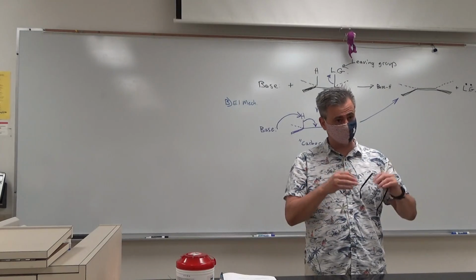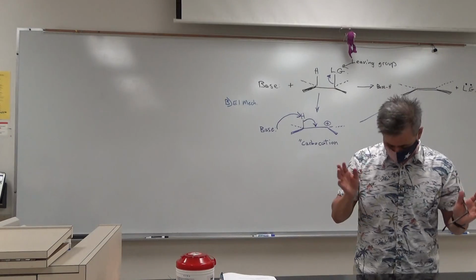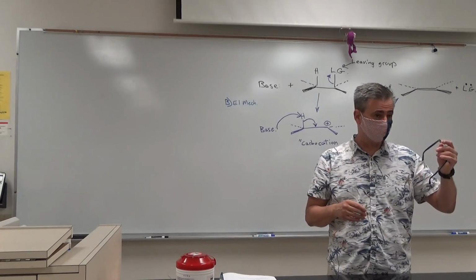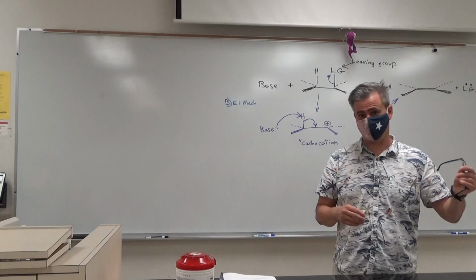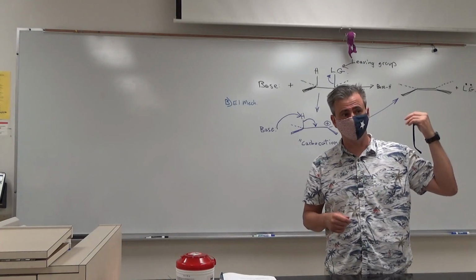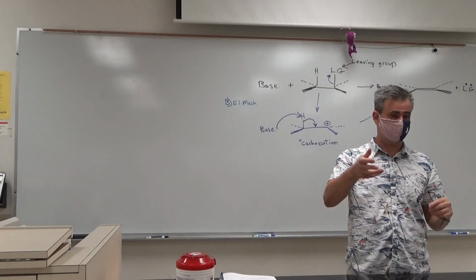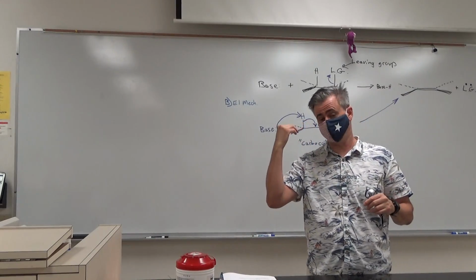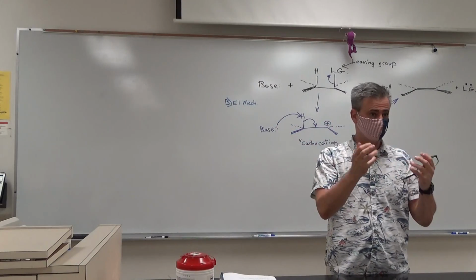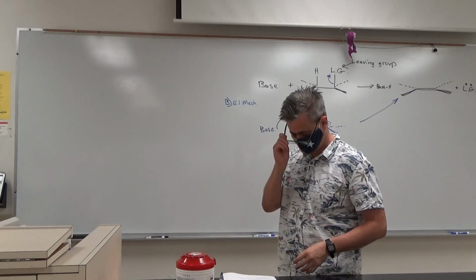You're going to partner up with somebody really only for data, because one of you is going to do 2-methylcyclohexanol, and then we'll get some data about how that reaction went. And the other one of you is going to do 4-methylcyclohexanol and get some information about how that reaction went. Then you're going to share your data, but that's as much partnering as you do in this situation.